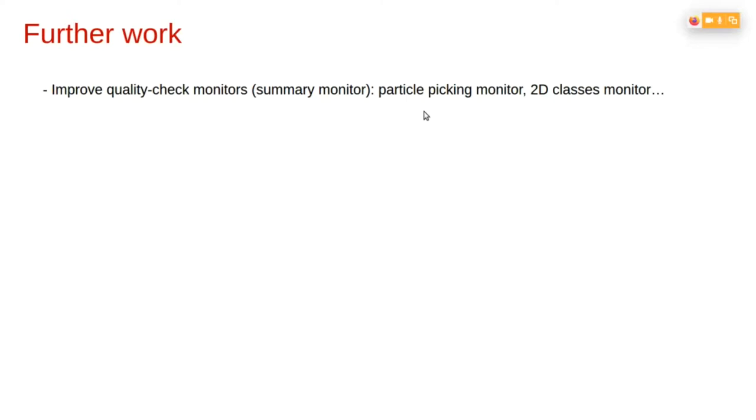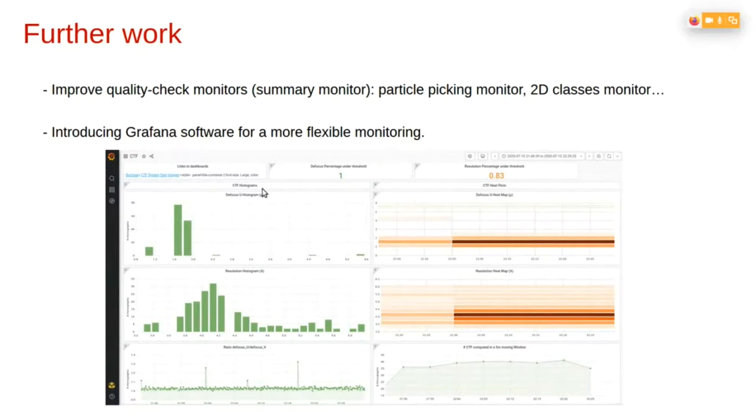Also, we are almost there in introducing Grafana software in order to make the summary monitor. We have seen the HTML report that is reporting all the important things during the acquisition, but Grafana provides more flexible monitoring because the information at the beginning is the same, here for instance the CTF parameters, but all those panels can be moved, or you can turn those panels, or you can include more charts in a very flexible way.